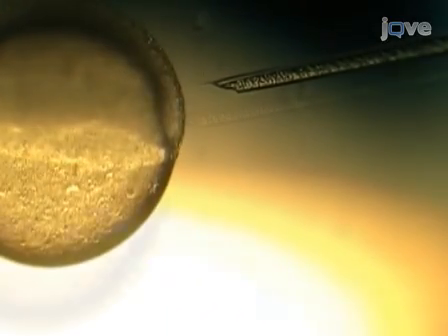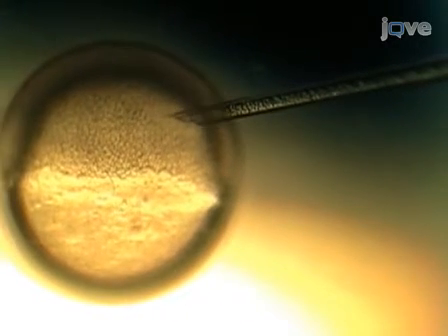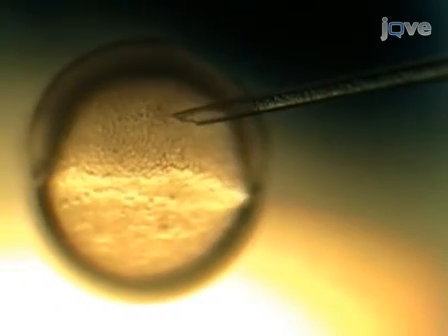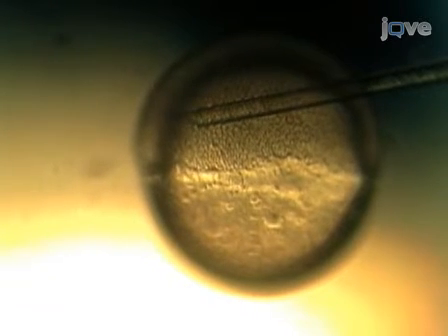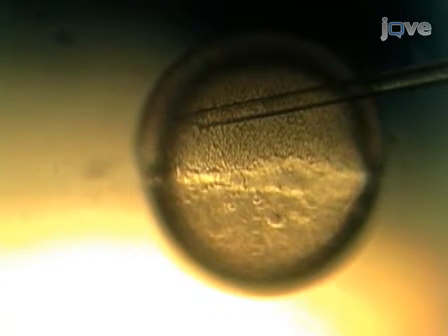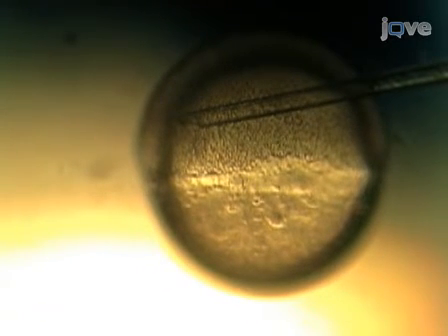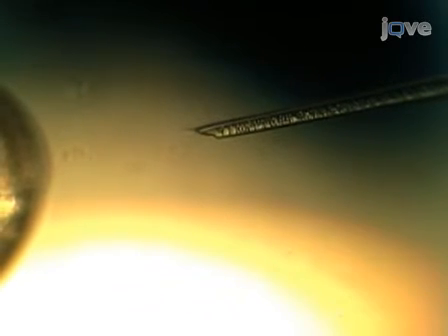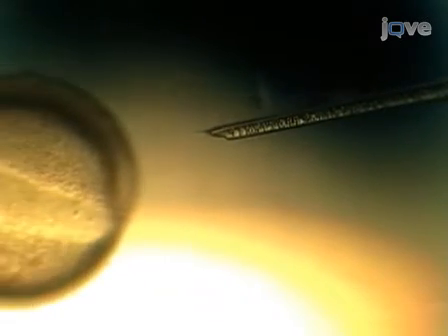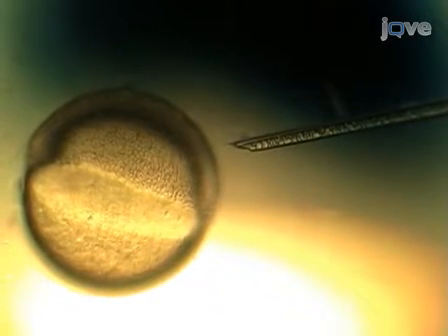If desired, additional embryos can be harvested for more cells using the same needle before ejecting the cells into the host. During cell ejection into the host embryo, expel the cells while the needle is being drawn through the targeted area, as opposed to depositing the cells in a single clump. This will increase the likelihood that the donor cells will contribute to the desired tissue. Once the cell transfers are completed, place the entire slide into a petri dish and carefully flood it with pen strep embryo medium. Over the next few hours, the methylcellulose will dissolve, releasing the embryos.